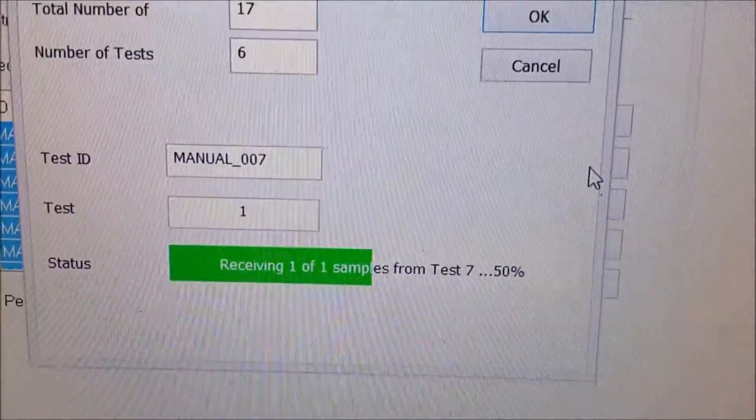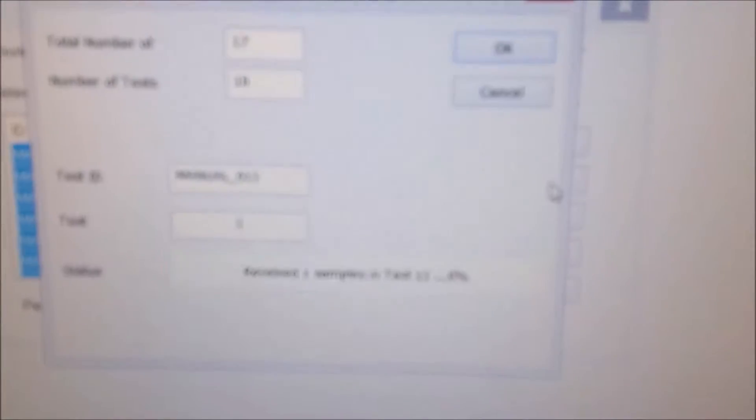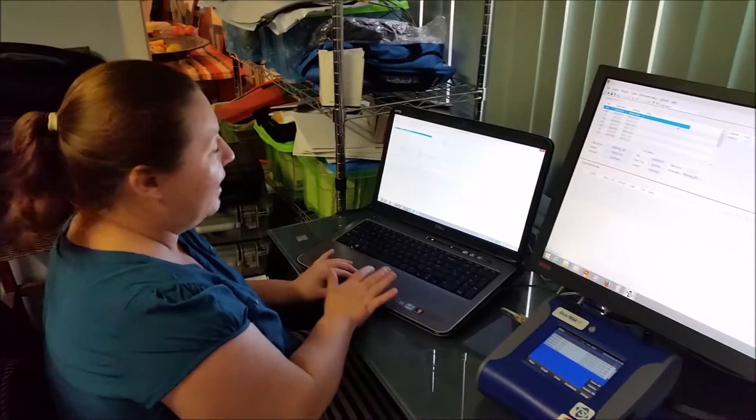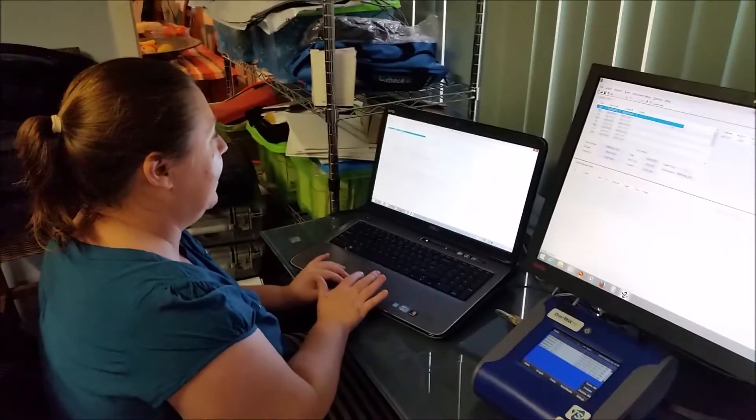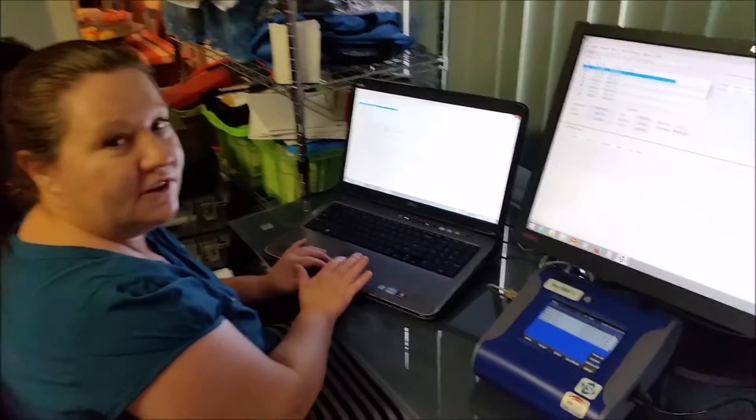Now, it's transferring the data from the actual Dust Track into the TrackPro program. So, this is how we transfer and print out the data.